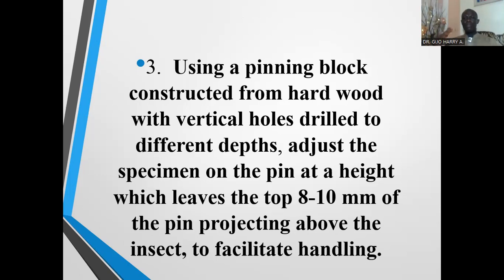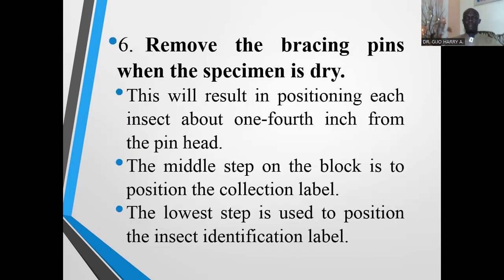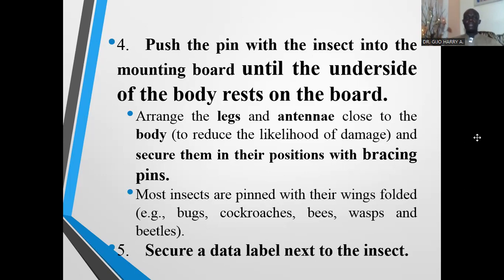So we use the pinning block, and it's made up of hardwood, though it can be improvised. We can use packaging floaters instead of the pinning block if it's not available to preserve these insects and arachnids. The fourth step is to push the pin with the insect into the mounting board until the underside of the body rests on the board. The insect is then pinned on the mounting board until the underside of the insect rests on the board. You now arrange the legs and antennae close to the body to reduce the likelihood of damage and secure them in their positions with bracing pins.